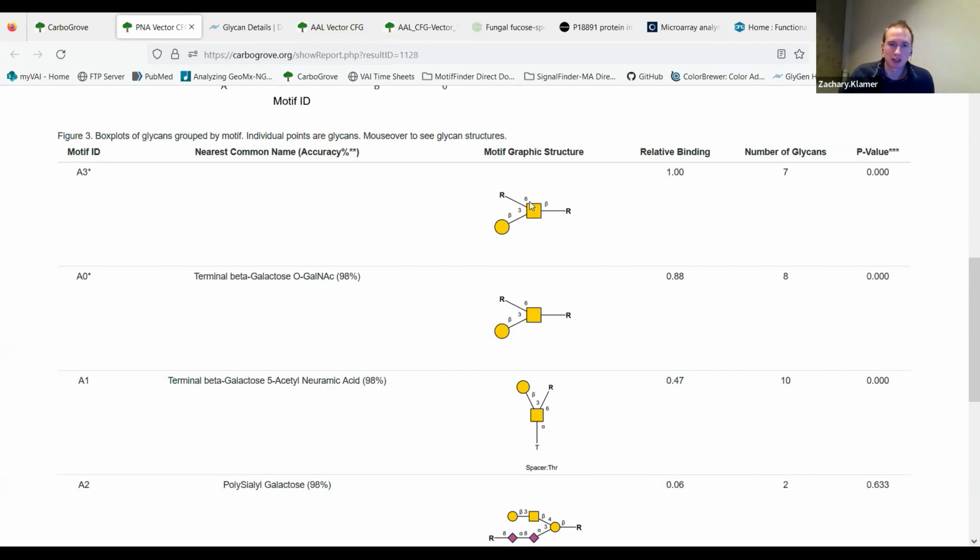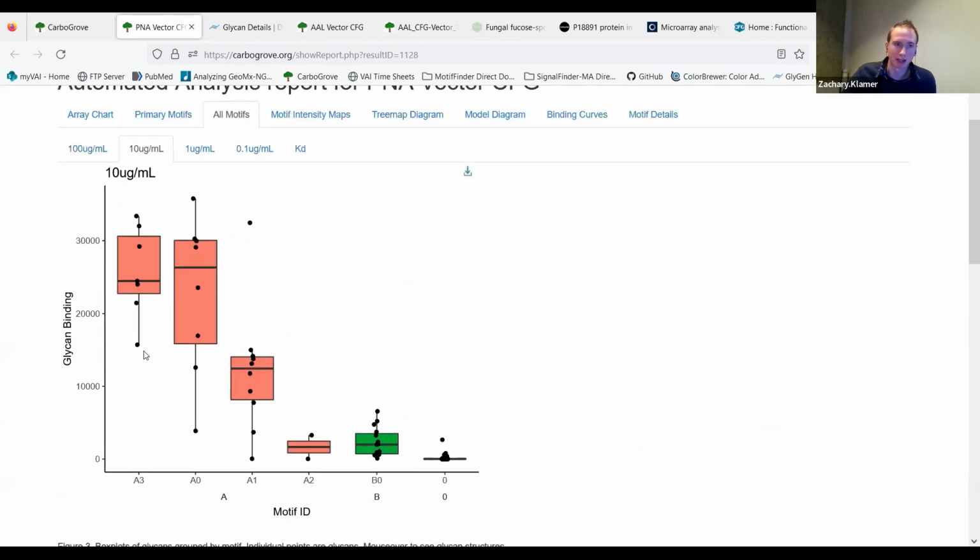And this must indicate then that we're looking at either glycolipid presentation or possibly some unusual beta presentation for an O-glycan. Traditionally, this epitope would be presented as an O-glycan as an alpha link to the protein backbone, but in some cases, the array provider might have beta presentations, such as this, where you have a beta link to the backbone. But this is a glycolipid, another glycolipid, etc.